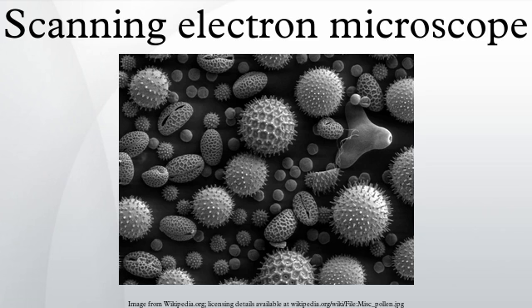3D and SEM. SEMs do not naturally provide 3D images, contrary to SPMs. However, 3D data can be obtained using a SEM with different methods such as photogrammetry, photometric stereo, also called shape from shading, inverse reconstruction using electron-material interaction models, and vertical stacks of SEM micrographs plus image processing software. Possible applications are roughness measurement, measurement of fractal dimension, corrosion measurement and step height evaluation.